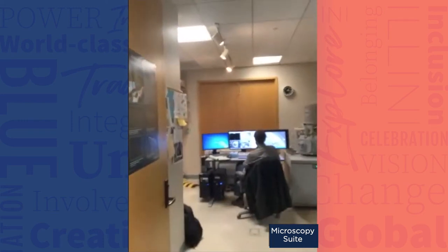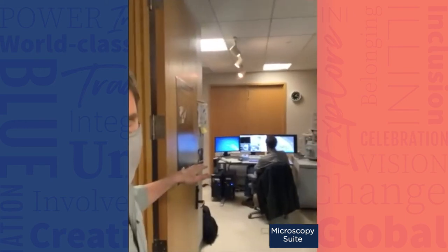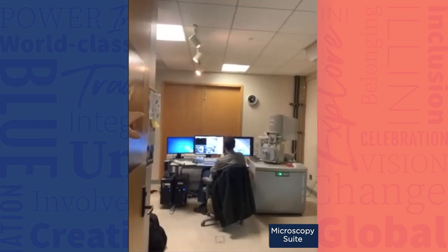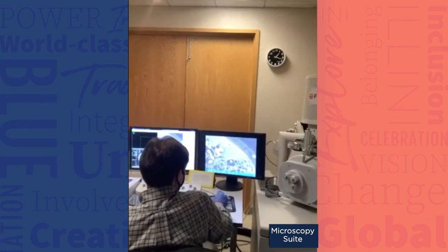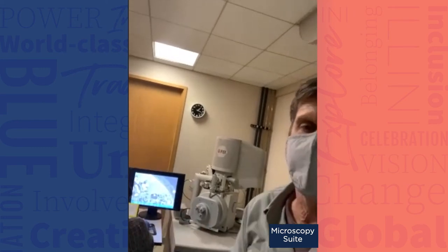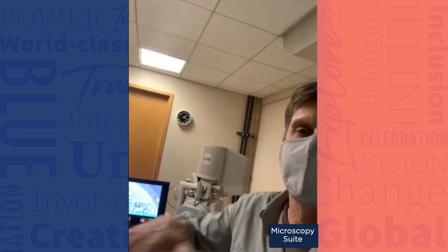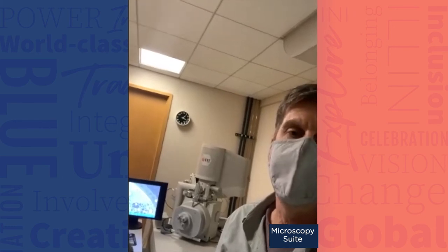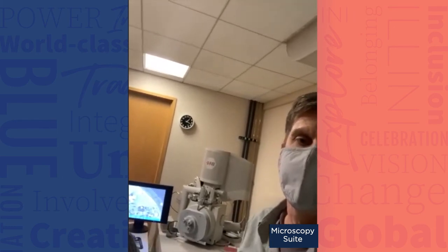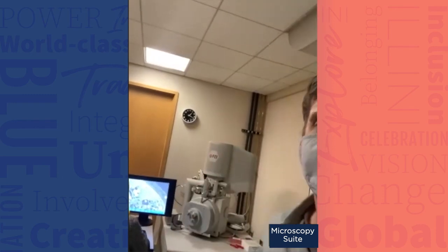This is an environmental scanning electron microscope, which also functions as a regular scanning electron microscope. It has a field emission gun. What Nate is looking at right now are cross-sections of nematodes — 40 nanometer thick sections sitting on carbon-coated slides that have been coated with gold-palladium. Nate's bringing the focus in; he's using backscattered imaging to differentiate what he's looking at. They're really beautiful cross-sections. This system also has EDS on it so you can do elemental analysis.